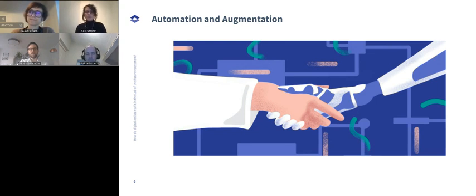Yeah, I think there you're really spot on, because it's about the repetitive tasks. But be aware, if you're in biotechnology, or even in the chemical space, or in general in the life science space, if you run an assay manually, you do it with your hands. Of course, you get better and trained because you're better in those repetitive tasks and make fewer errors, I would say. However, it's still a skill to put that onto an automated platform, because it's different if a robot is pipetting or if you as a human are pipetting, yeah?